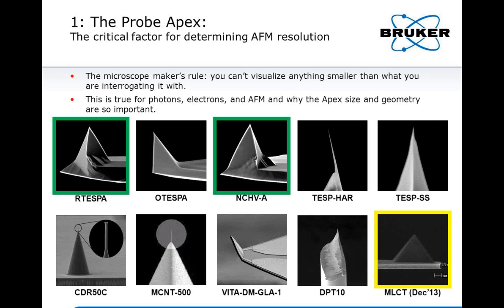First, let's discuss the probe apex. This is a critical factor for determining the AFM's resolution. The AFM probes come in a variety of shapes and sizes to meet many different application needs, from biological to semiconductors. The 2 most common workhorse probes are the standard tapping etched silicon probes that we've outlined here in green.